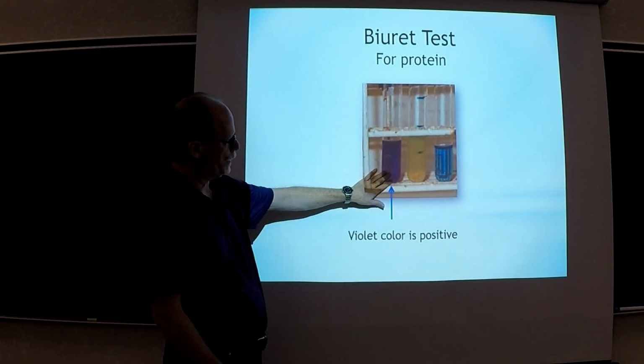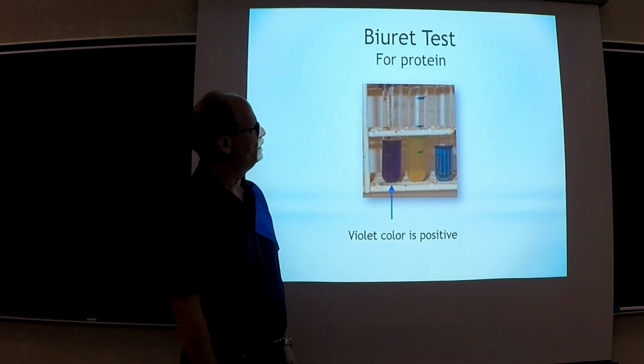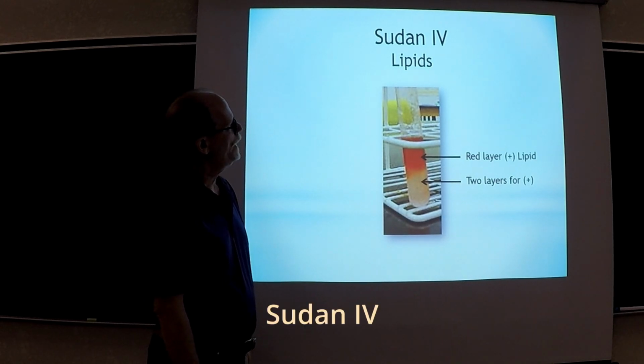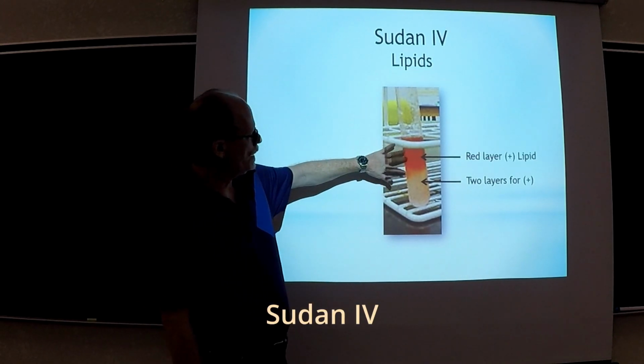That means protein is present; no protein found in that test tube. Now the Sudan 4 is a red color.